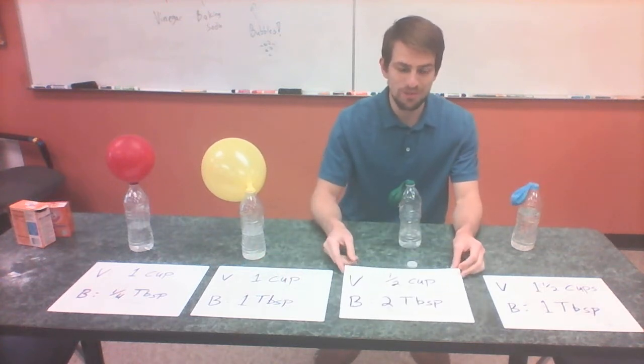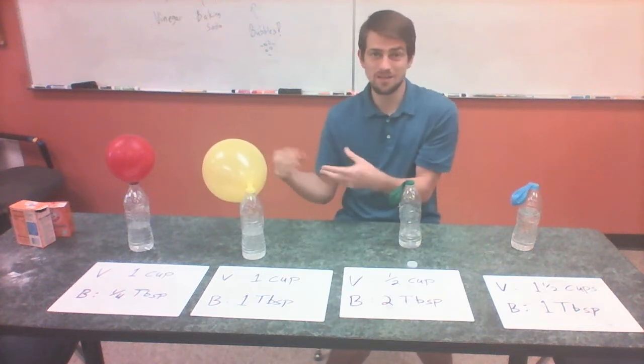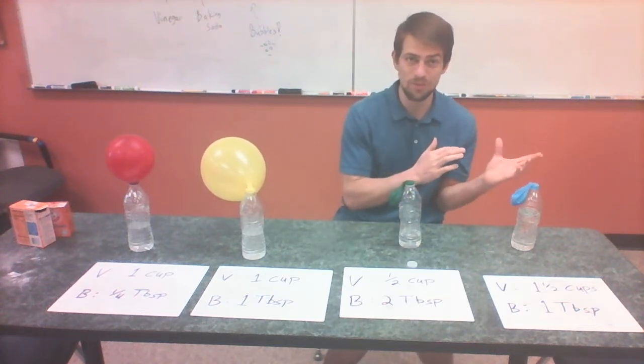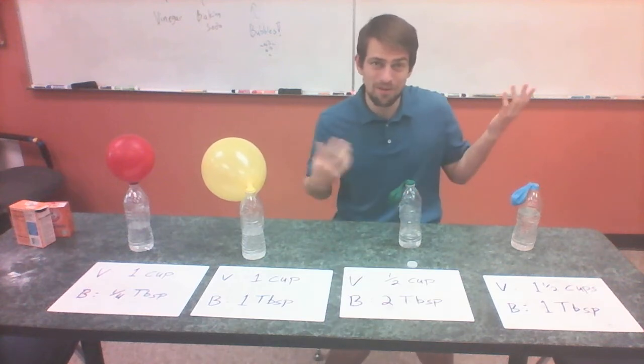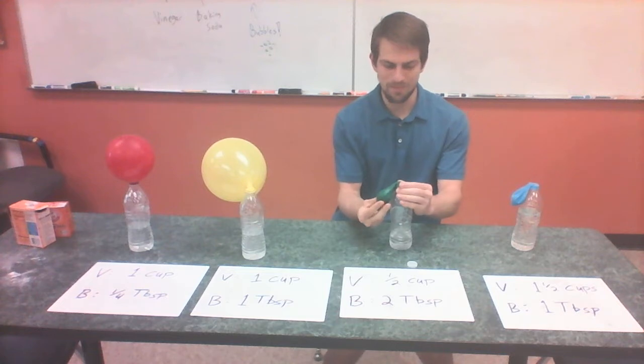So make your prediction as to what's going to happen with this one. Is it going to be twice as big as this one, half as big, the same size? Like maybe multiplying 1 by 2 and the other one by 1/2? Maybe they'll cancel each other out. Who knows? But let's go ahead and see what happens.